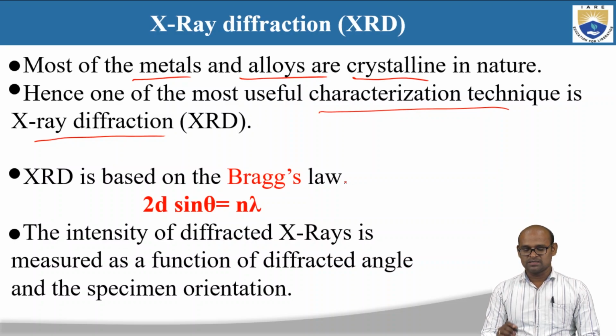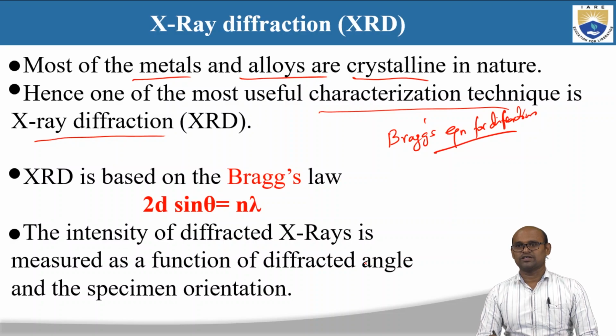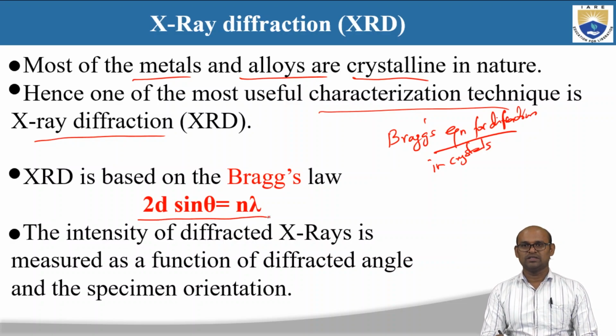XRD is done using Bragg's law. Bragg's equation for diffraction: Bragg studied the diffraction in crystals. If there is any diffraction in crystals, then this equation must be satisfied, that is 2d sin theta is equal to n lambda.